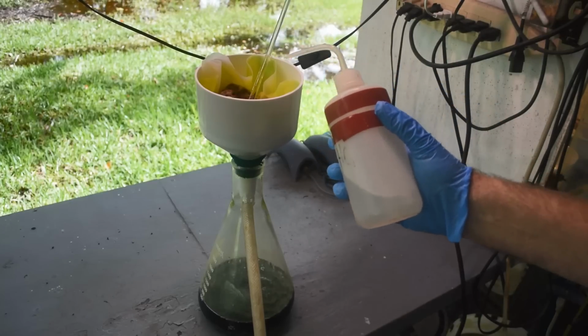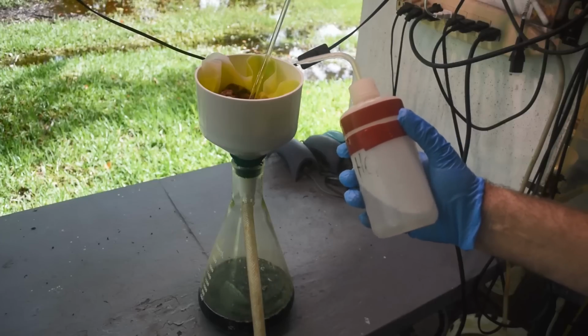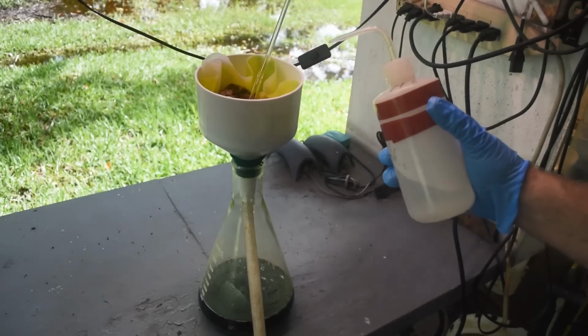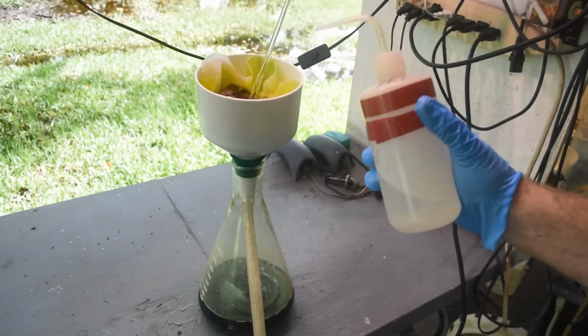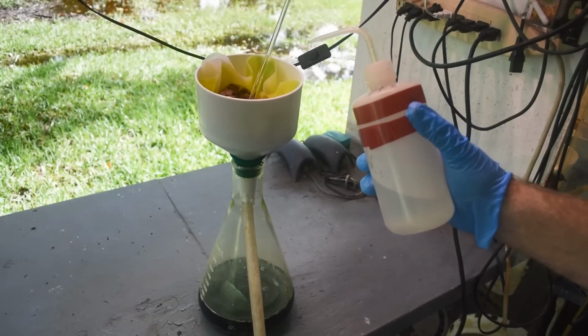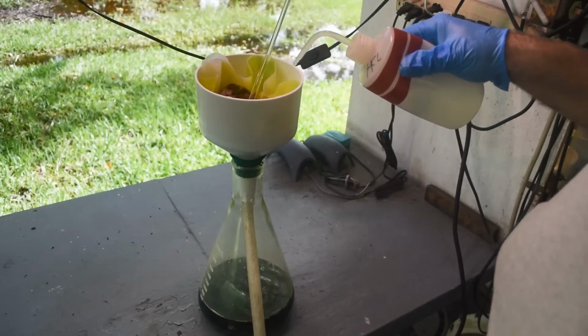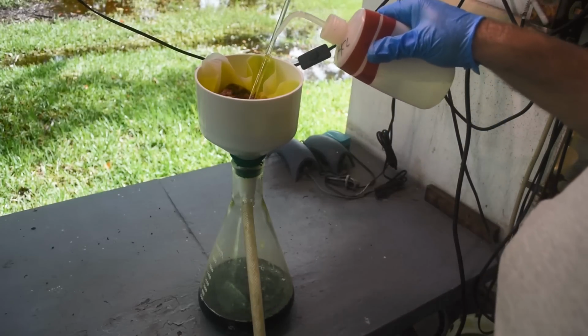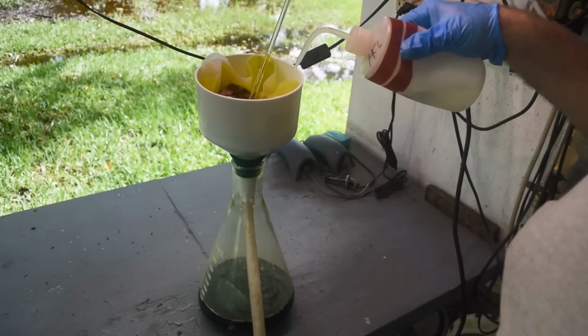I may have erroneously said earlier that hydrochloric acid will dissolve this stuff. It will not dissolve the red stuff. Straight water will. Water with at least 10 or 15% of ammonium chloride in it won't dissolve it. But hydrochloric acid won't dissolve it. So I can use it to wash this stuff. Try and clean it up a little bit.